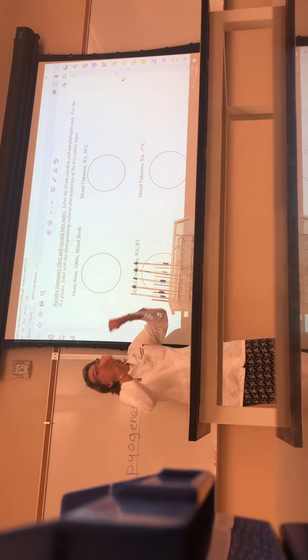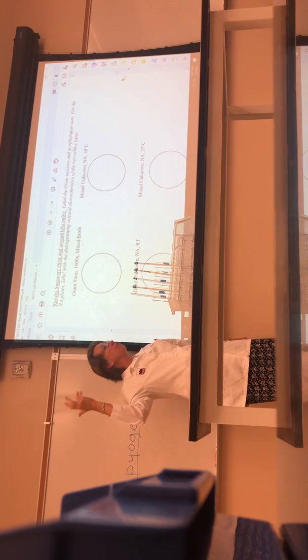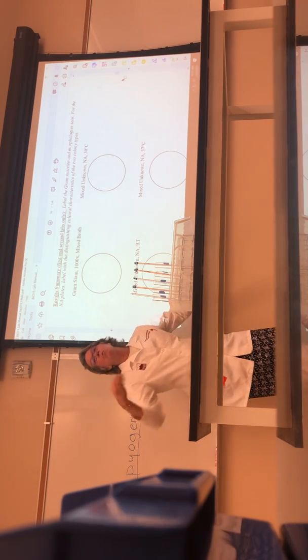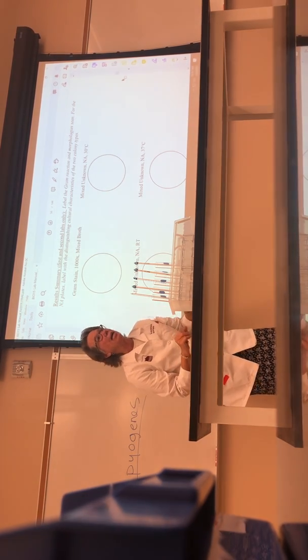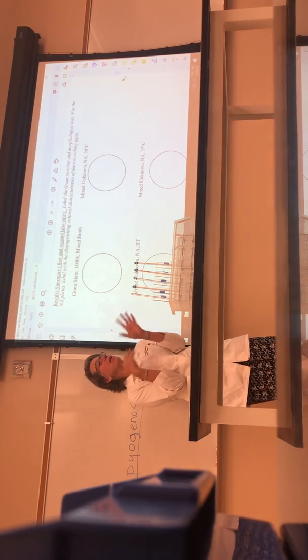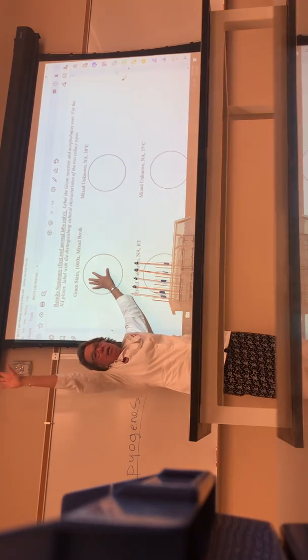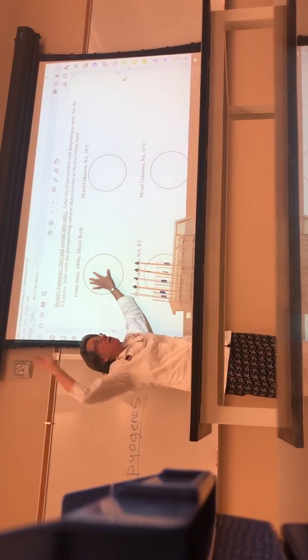So you want to do it as we go along. That's the whole point. When you work in a research lab or a medical lab, you've got to keep your data in real time. That means you've got to record it as you go along, okay? Because every day you're going to forget more and more. So hopefully you have something in there. How many of you have something written here? A gram stain, a mixture, okay?